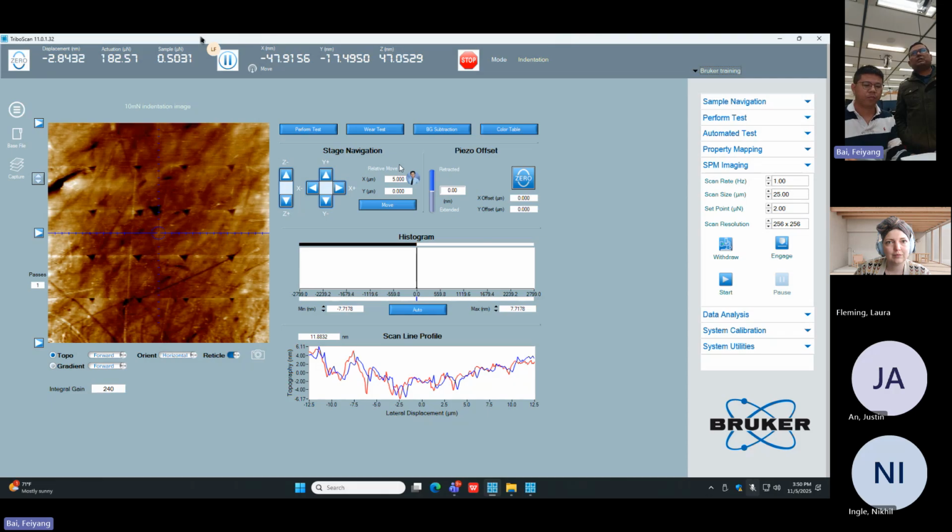One more question from that tip area function. In that tip area function, there was one outlier. Do we remove that and then do the tip area function? It would have been better if we had done that. I guess I just left it in there because it was only one. If you have more than one, definitely. I generally make an outliers folder and move them in there. Because we had one on 200, it didn't seem urgent and it didn't impact our results at all. It didn't change the fit, if you recall. If we had only done 10 indents, then absolutely I would have pulled that one out, because that's a 10% error. But in this particular case, it wasn't super important.